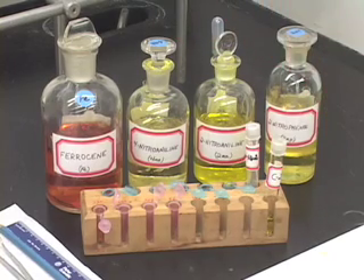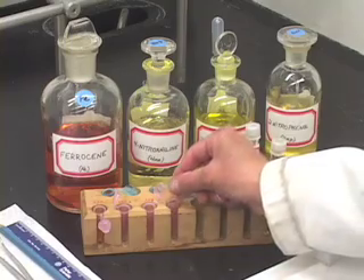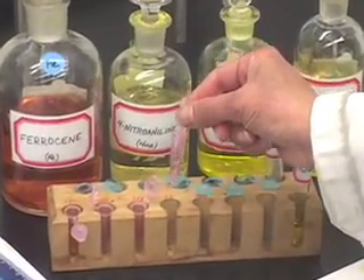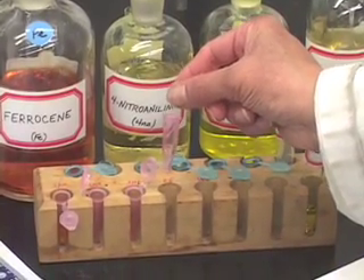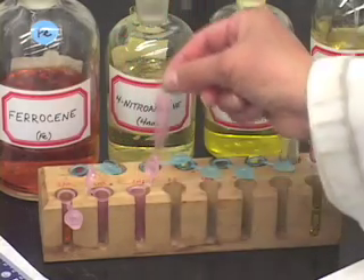How do we take the standard compounds? We take small amounts of standard compounds in these small plastic vials — just a few drops of each of the standard compounds in each of these four plastic vials.